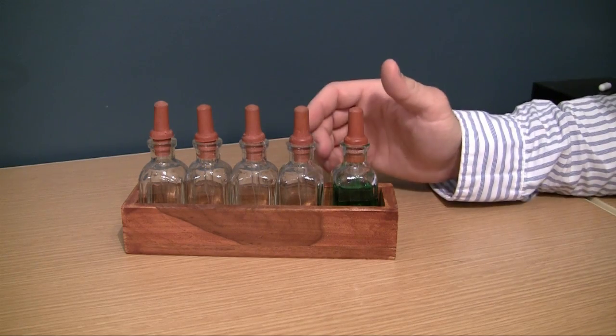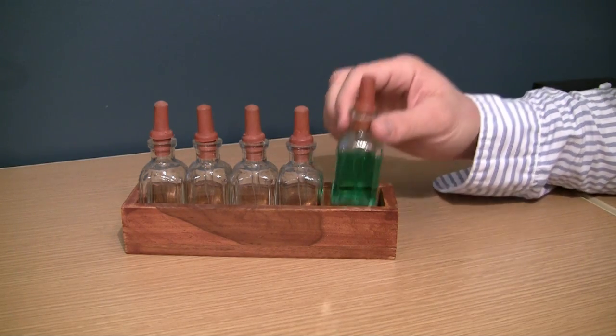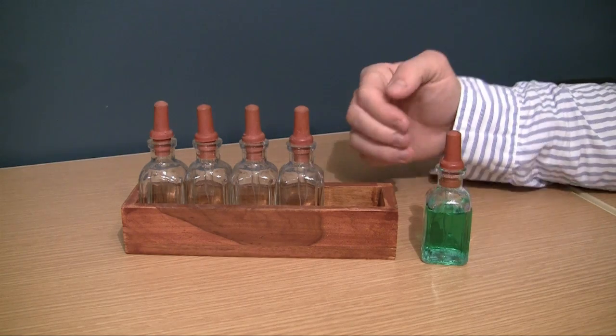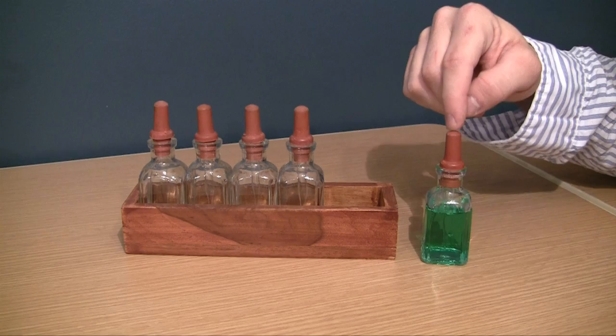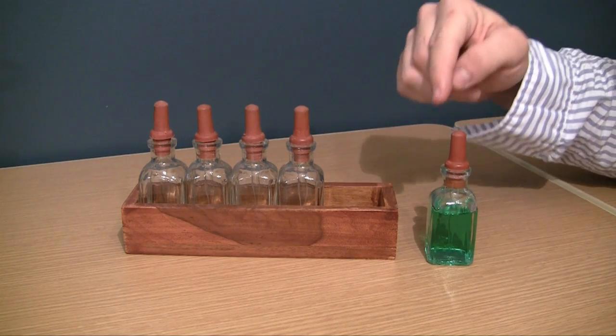And you definitely want to, even though you may think that you may not use it a lot, these are actually really handy so if you're starting a home chemistry lab or you're going to start making meth or anything, these things are actually going to be really handy, definitely worth the investment.